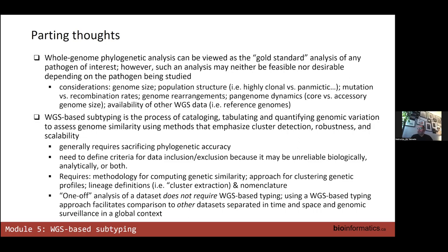If you have a PhD student who is going to be analyzing several hundred genomes, just do the proper thing and do a proper phylogenetic analysis, maybe put it through some of this type of voodoo so that you can generate data that you can compare to other studies and so forth. But this is not about being phylogenetically correct.